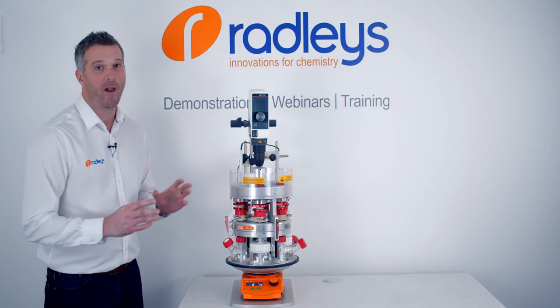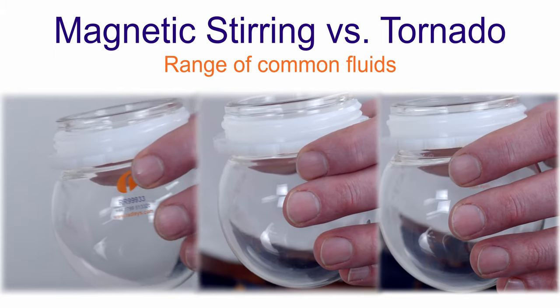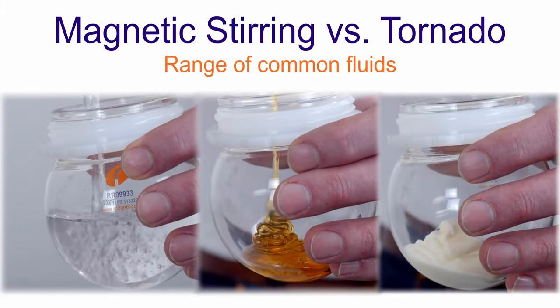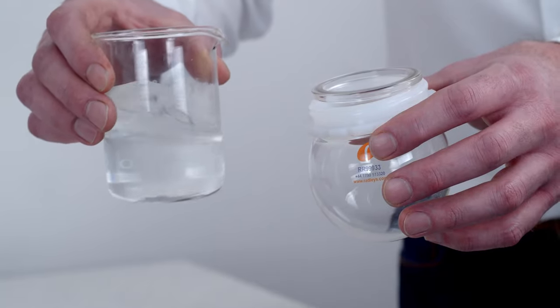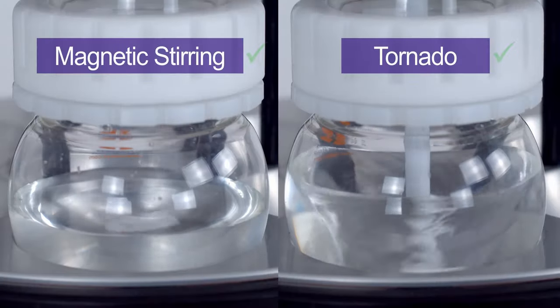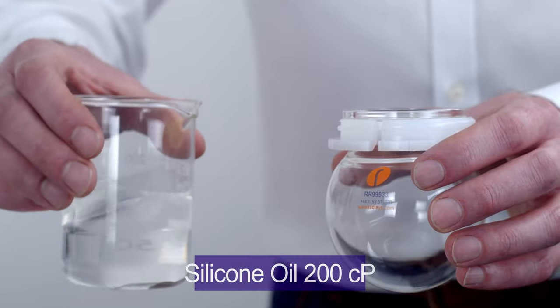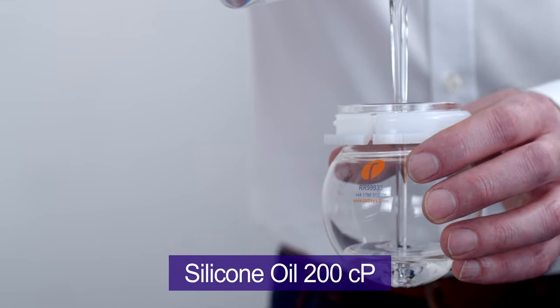Now we've had a look at the hardware, let's take a look at what it can do. We're going to stir a range of common household fluids with the magnetic stirrer and with the Tornado overhead stirrer. You'll see there's a range of viscosities here from water through to honey and yoghurt. The magnetic stirring is absolutely fine for low viscosity fluids with a low solid loading, but the more viscous fluids will need mechanical overhead stirring to mix.